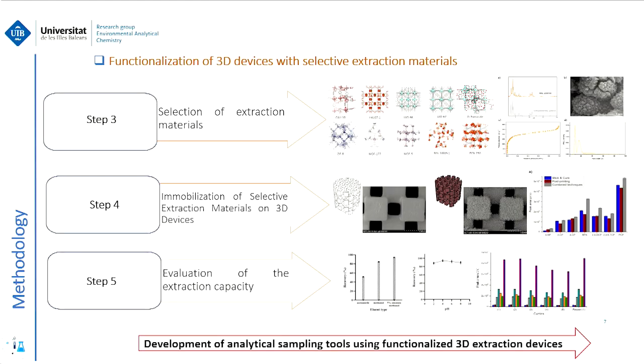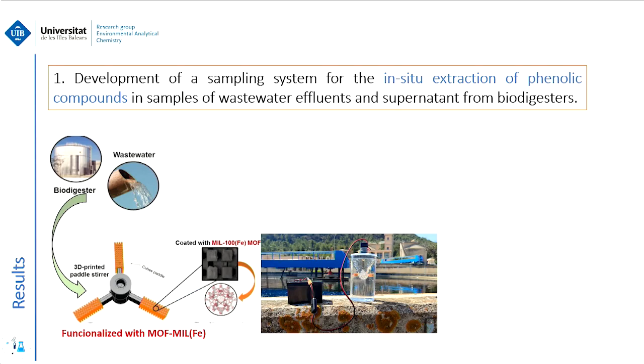Now I would like to show you different developments of analytical sampling tools using this kind of device for extraction and analysis of samples. The first one is the development of a sampling system for in-situ extraction of phenolic compounds in wastewater samples. You can see here we developed this device functionalized with a MOF.